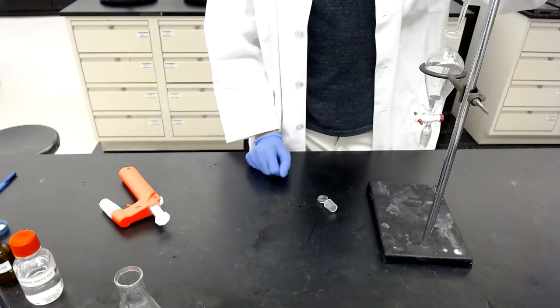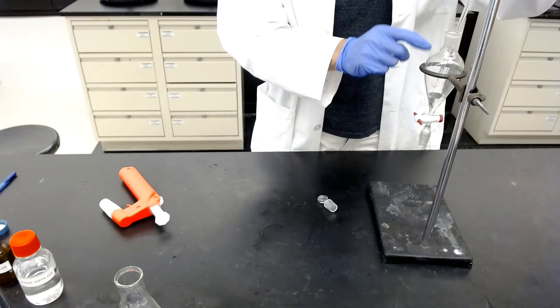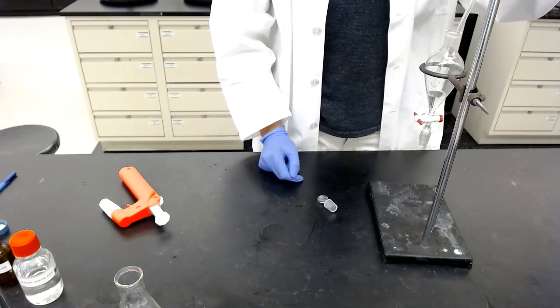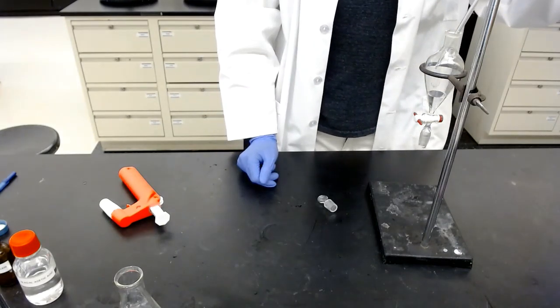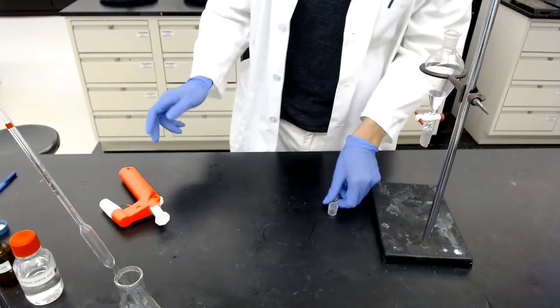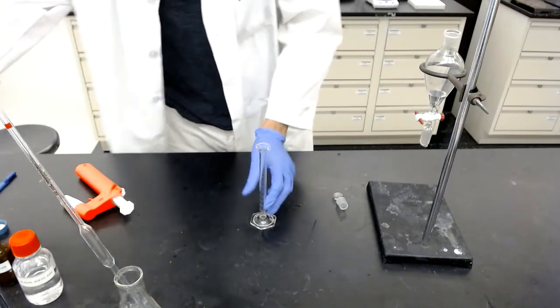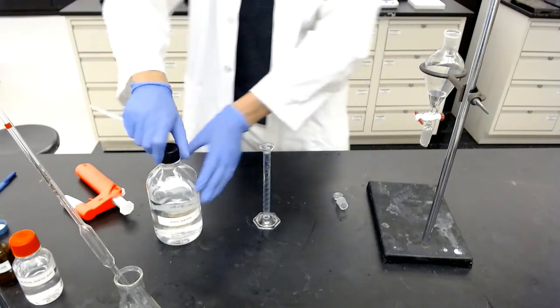And then the next is we're going to extract this acid solution with ethyl acetate again, also using another 10 ml, just like we did not too long ago. But this 10 ml of ethyl acetate is going to be broken down into 2 portions. Each time is 5 ml. In total is 10, of course.